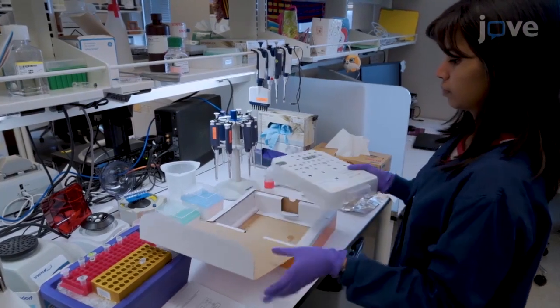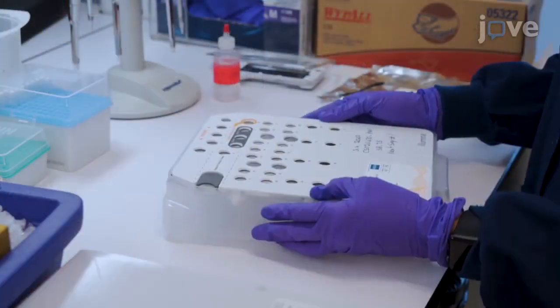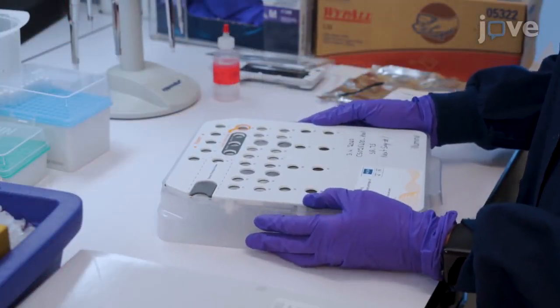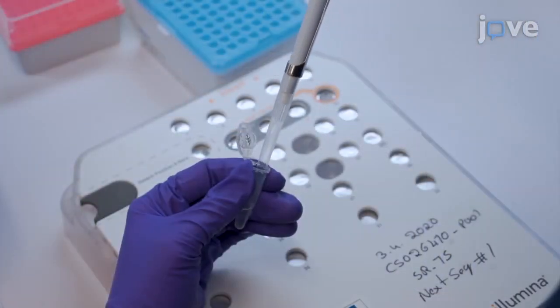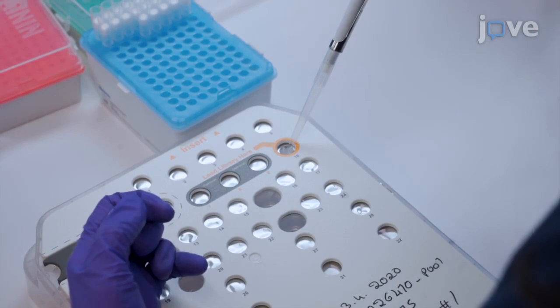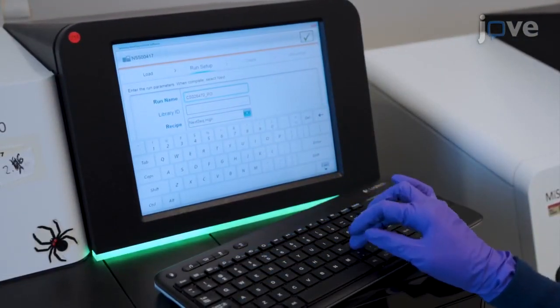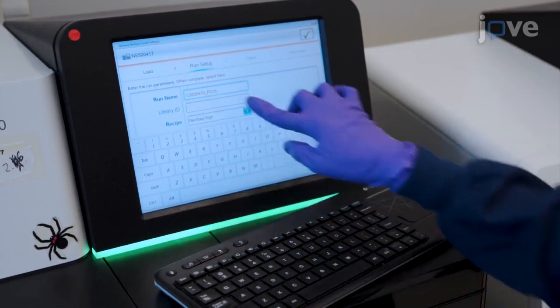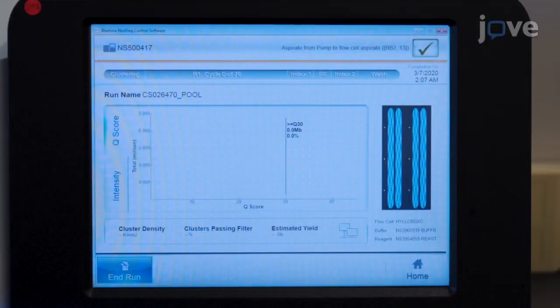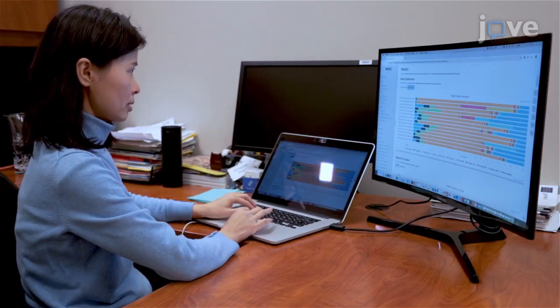The FFPE-RNA degradation and selection of the methods for sample QC, library preparation, and data analysis can all be very tricky. Be meticulous when selecting the right methods and appropriate controls. Visual demonstration allows viewers to observe the small, subtle modifications and precautions needed during the planning, assessment, and sequencing process, especially for poorly preserved FFPE samples.